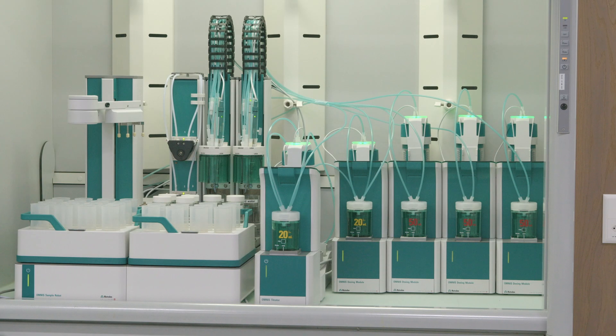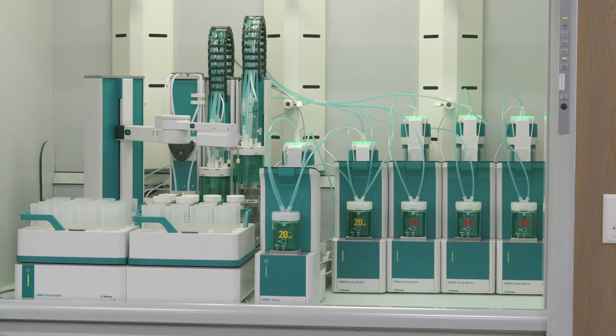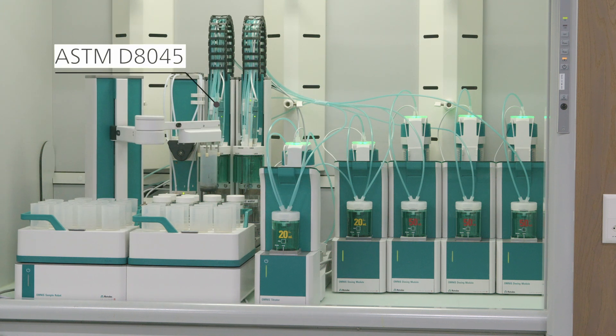If you have a high sample throughput, you can automate your system with an omni-sample robot. On one workstation, you can determine the acid number thermometrically according to ASTM D-8045.